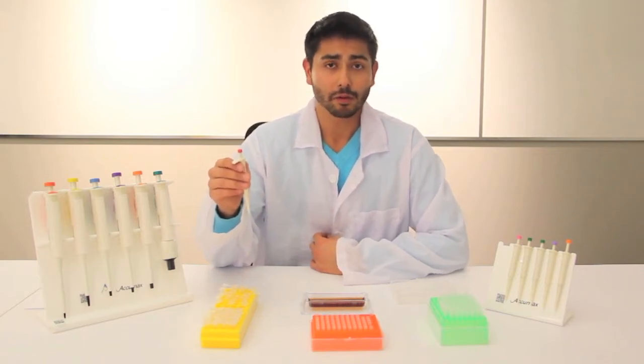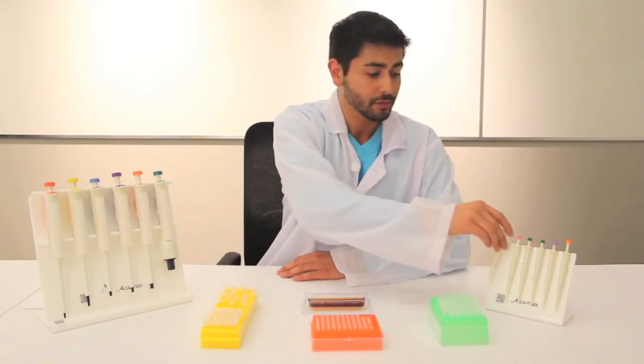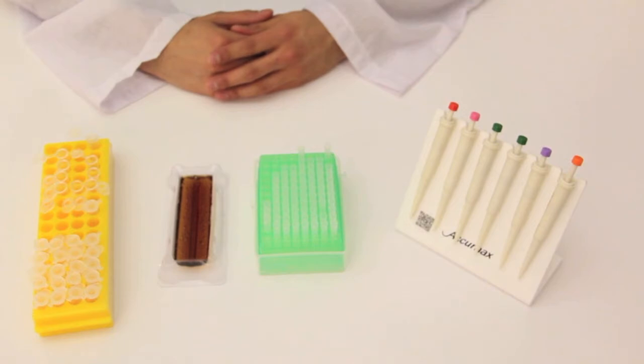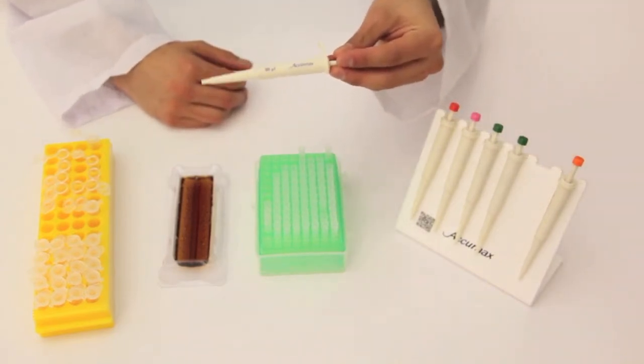So if anything happens to them within three months and they become dysfunctional, just send them back and we'll replace them free of charge. To demonstrate the AcuMax Junior Pipettes, we'll be using the 50 microliters pipette.